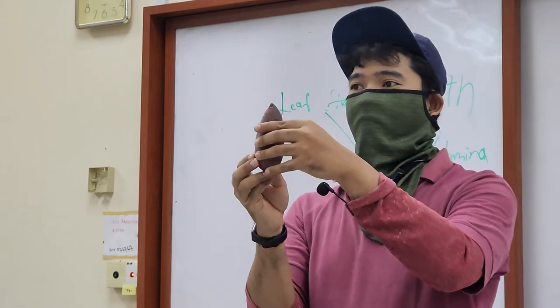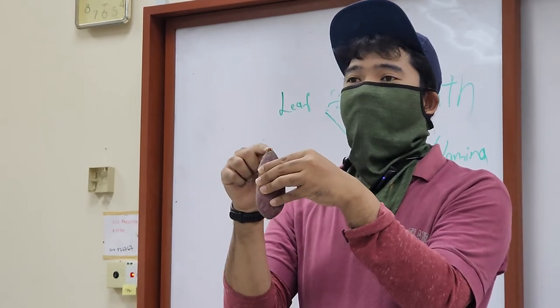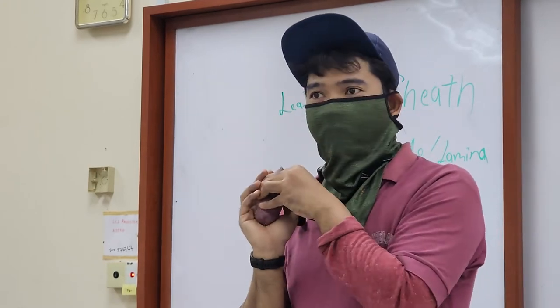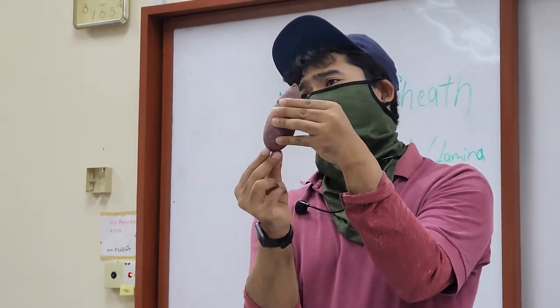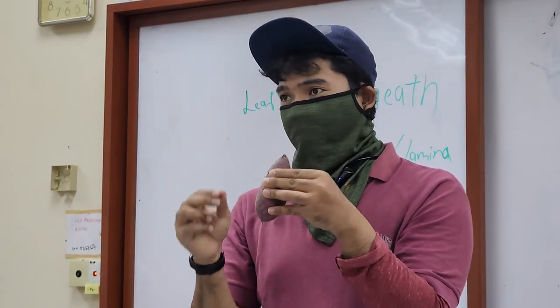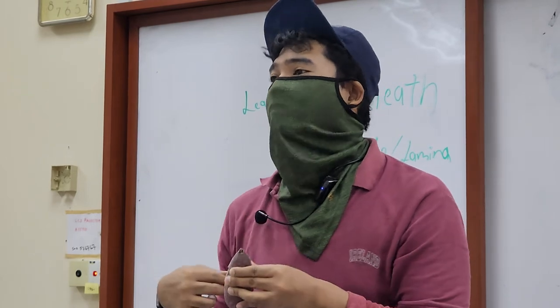All right. Just now. Oh, one more thing. For this one, you need to know which is the top and which is the bottom for your potato. When you're labeling your potato, the top part is actually the apical bud of your potato. This is not potato, okay? I'm talking about the potato, your actual potato. You need to know the apical part and also the stem part of your potato, okay? Because the apical part can give rise to the new plant. The stem part is actually from where the tuber came from. Right? Okay. All right. Okay.